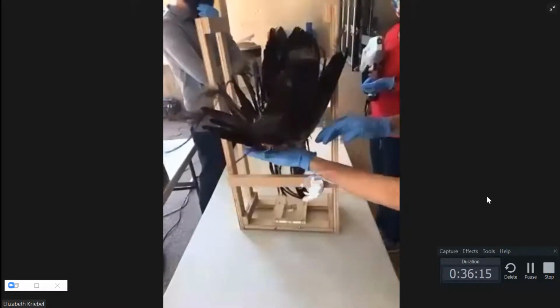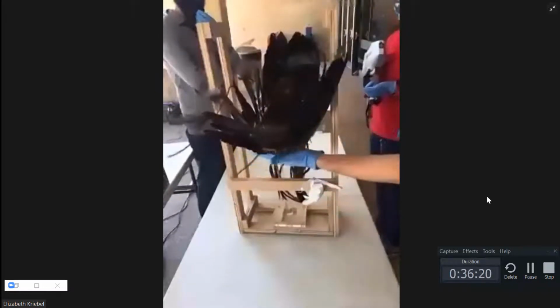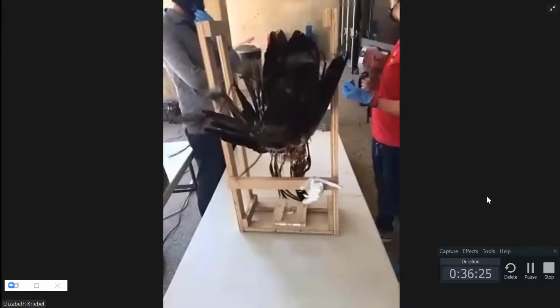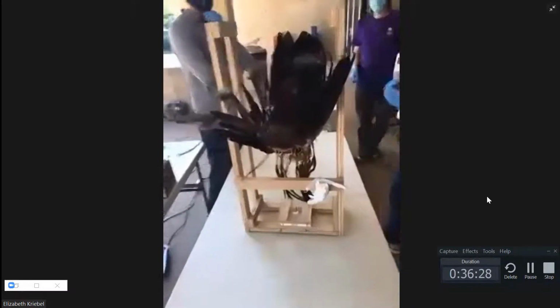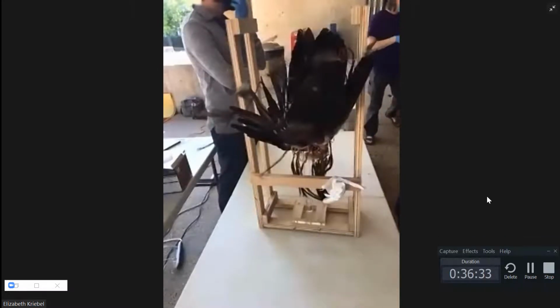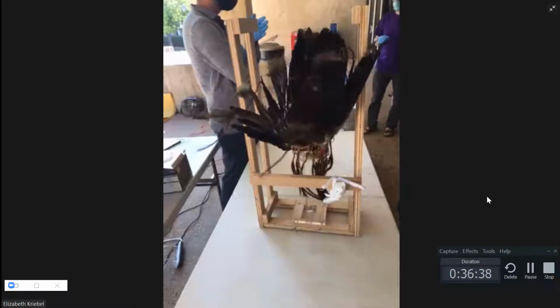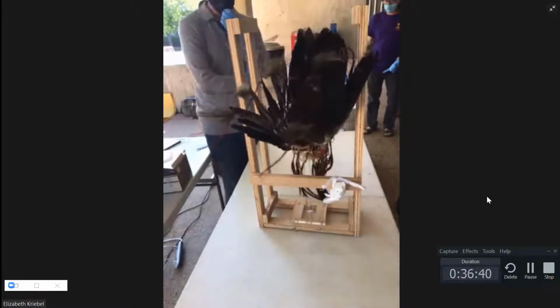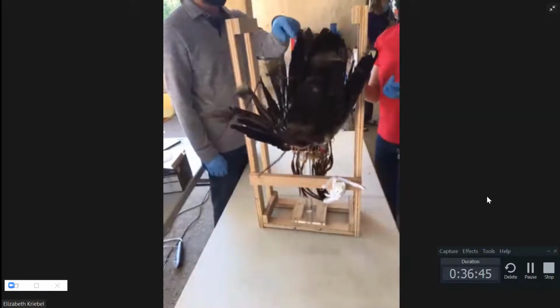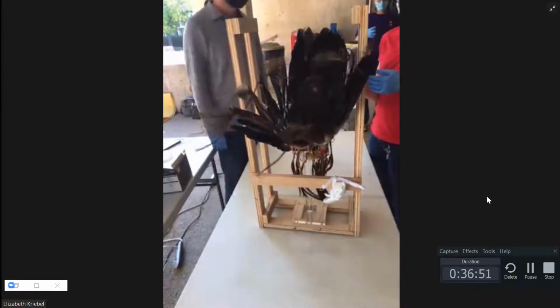So we're going to see what we can do to do this in a stable fashion. It's got leather, of course, for the cap. All right, so the feathers and the felt are our first orders of business here. This is one of those scenarios where safety gets much more challenging given the nature of the object, because the X-rays are going to blast right through these feathers. I think you want to measure at this side here, so the X-rays are going in this direction and no one will be back there. Exactly right. Okay, here we go.